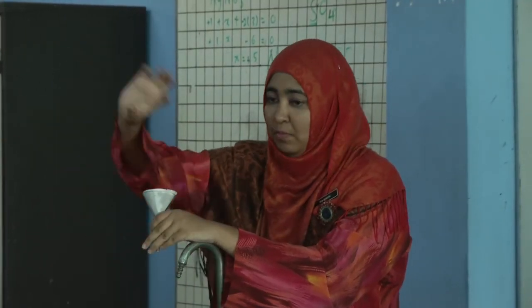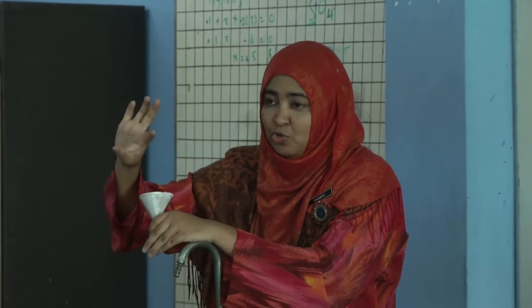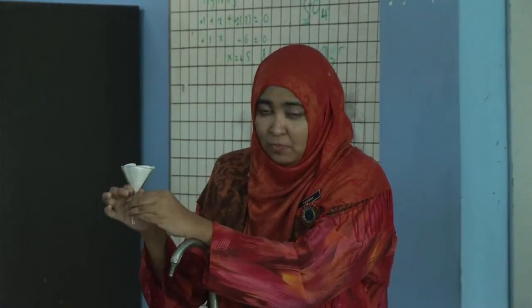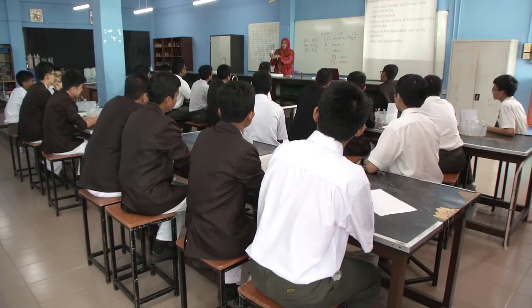And then you start to pour. Right? When you pour your two solutions, and after that, you pour the solutions in this filter funnel and filter paper. And let gravity do its job. Okay? Clear? Yes. Okay, you can start your experiment now.